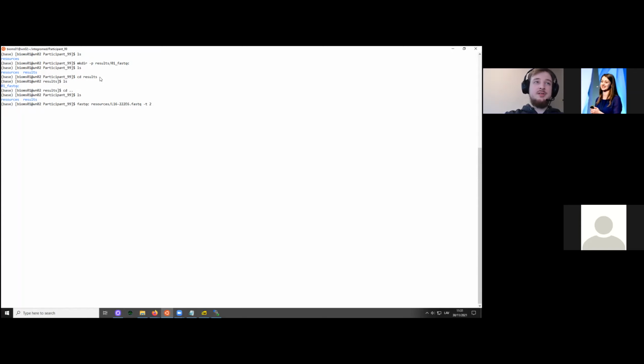Maybe some programs are not optimized at all, and they can't use many processing cores. Some can't use very many, and some programs are optimized to use 16, and I know that more is not necessary. So we're going to use 2.